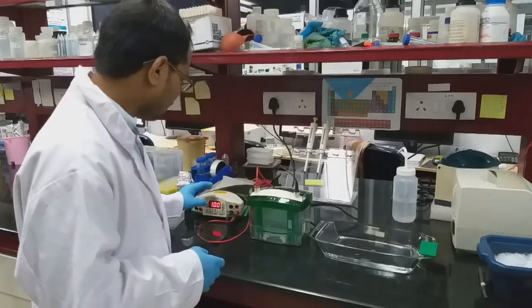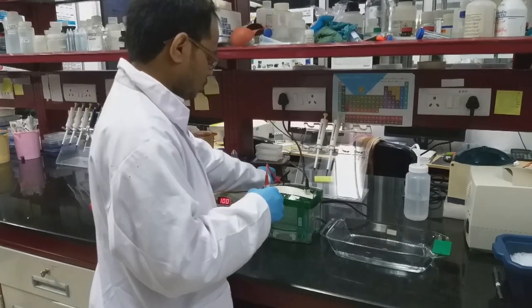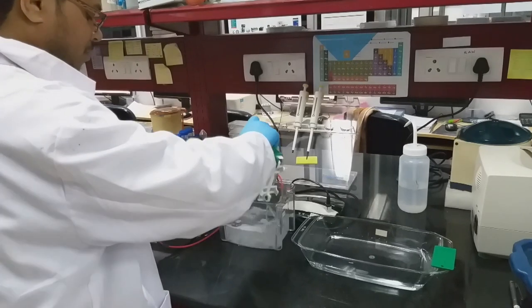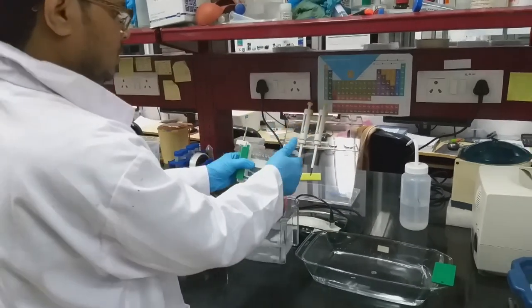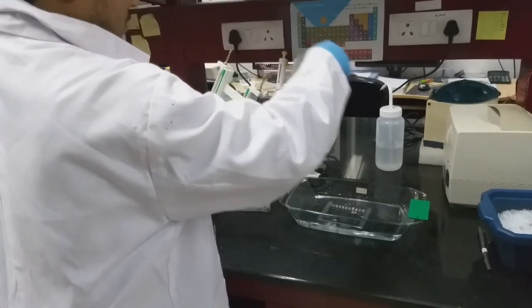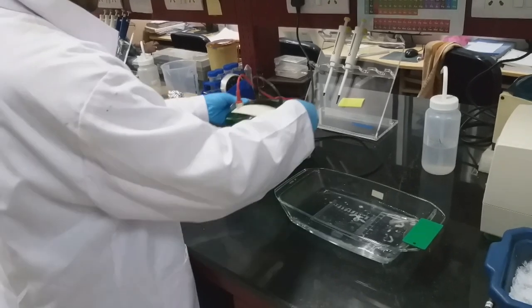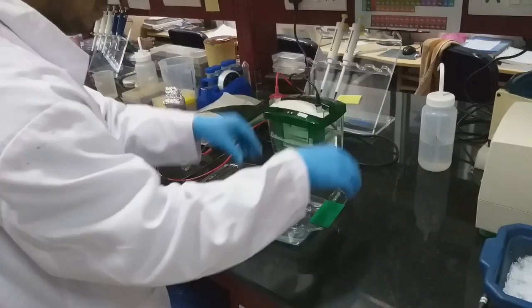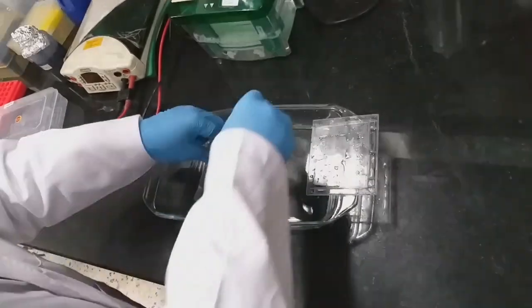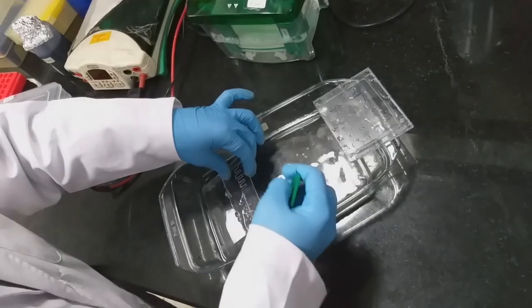So I'm going to stop the run, then I will remove the gel. I'll show you how to remove it. Take out the glass plates. Here we have to be very careful while taking out the gel, otherwise the glass plates may break. On a corner we have to take and lift the gel like this.